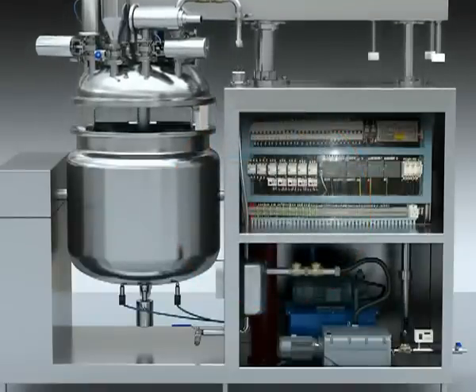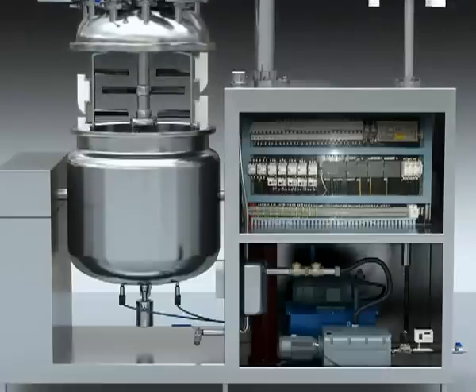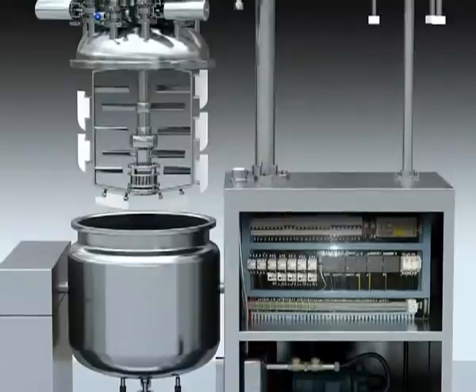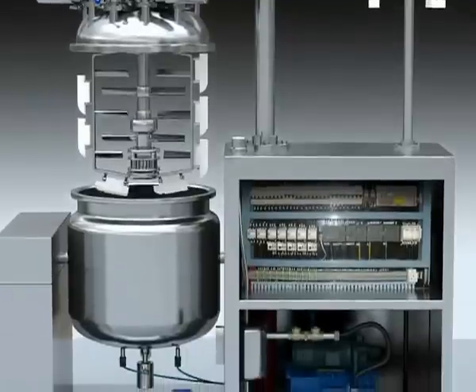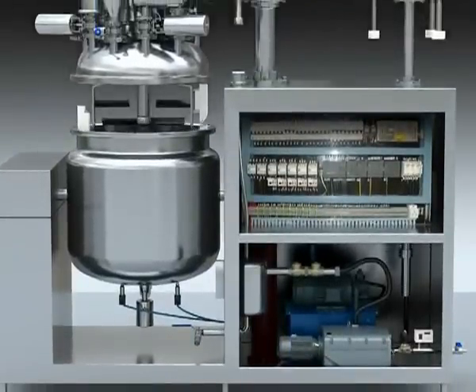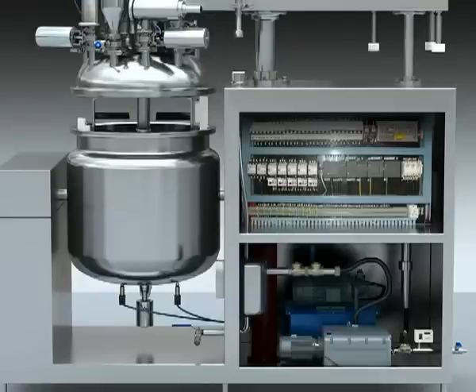If the Immersifier tank is reset and there is no vacuum in the tank and the safety switch is in this position, then upper and down ceiling heads will start to move up and down. When the upper ceiling head reaches the low limit, the Immersifier tank begins to lean, and in the tank there is vacuum protection. Everything will stop in the current position if the stop button in the HMI is pressed.